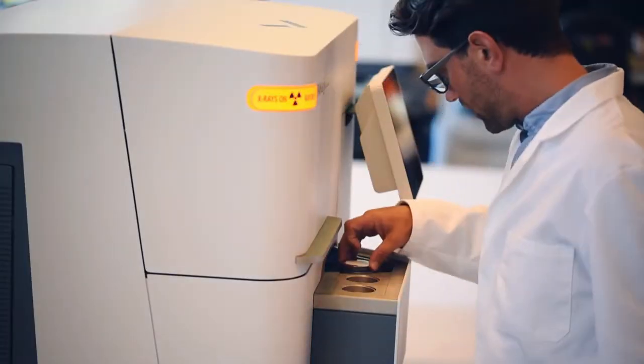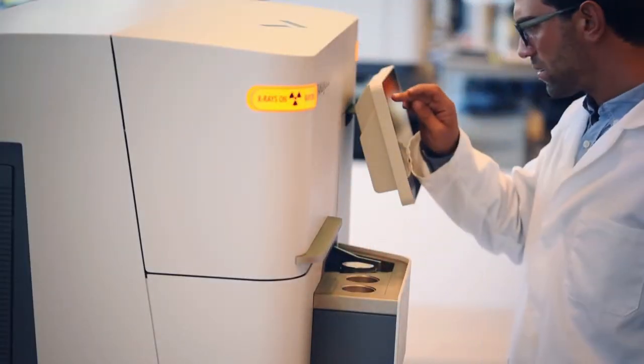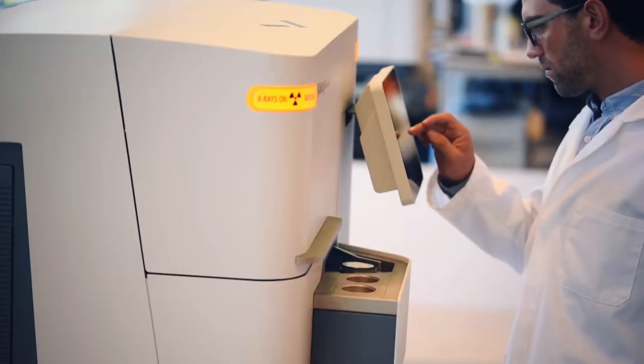It's like making a cup of coffee really, except that it's even easier than that. You'll see. The new AERIS XRD benchtop by PANalytical.